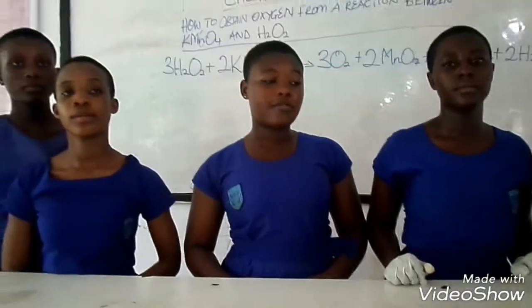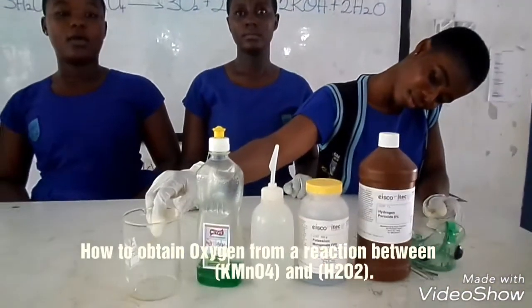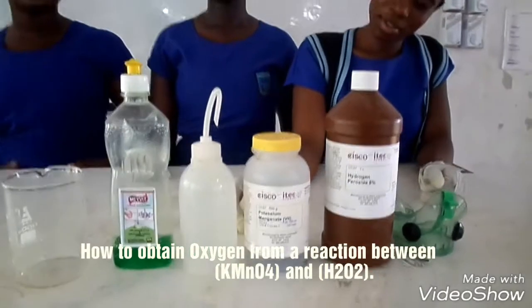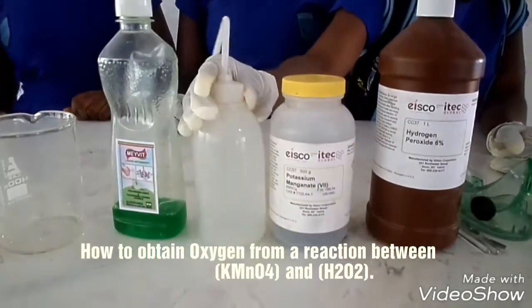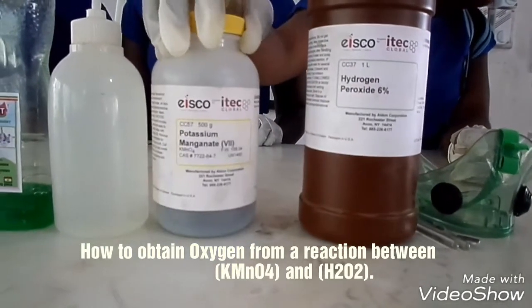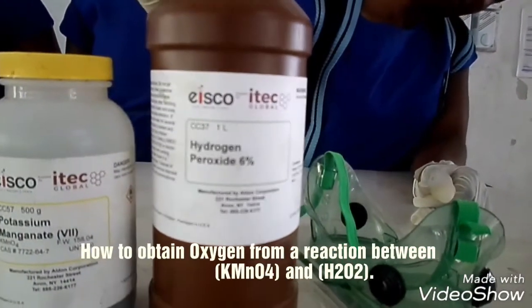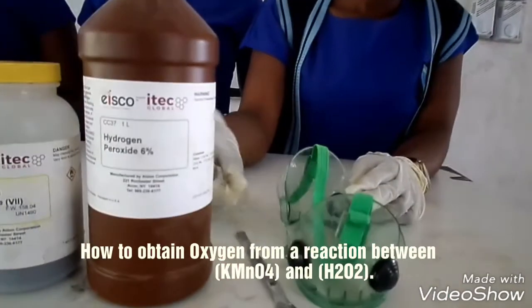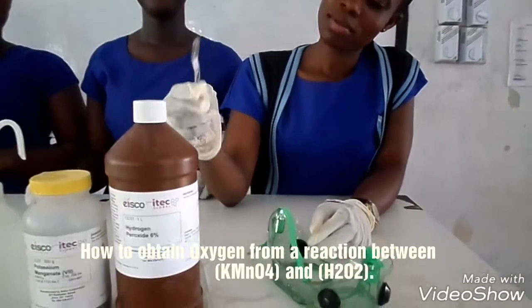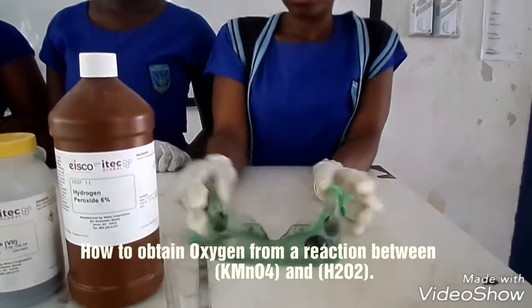The apparatus needed for this experiment are a B-cap, a bottle of liquid soap, a wash bottle which contains distilled water, a bottle of potassium permanganate, a bottle of hydrogen peroxide, a sterile which is going to be used to stir the solution, and a spatula which is going to be used in fetching the potassium permanganate.